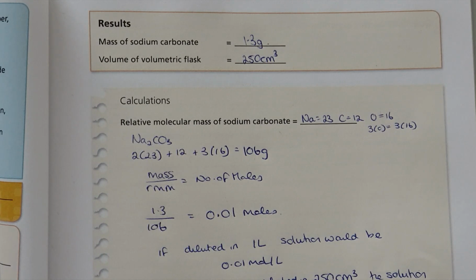Also, we have a volumetric flask of 250 centimeters cubed. So when you're working out the concentration of this solution, those two figures are very important to your calculations.